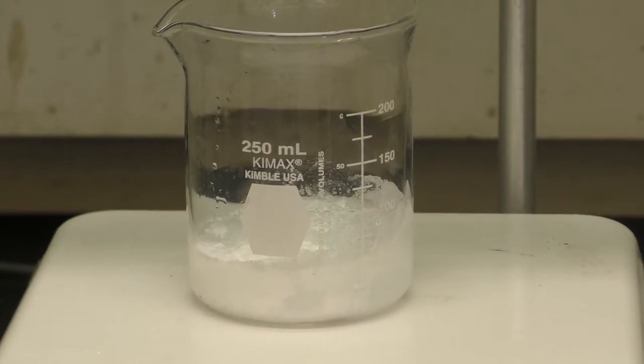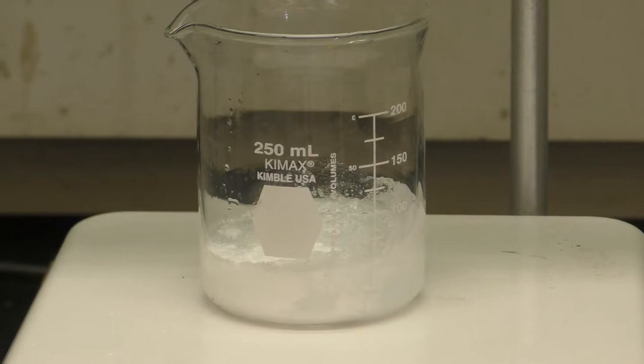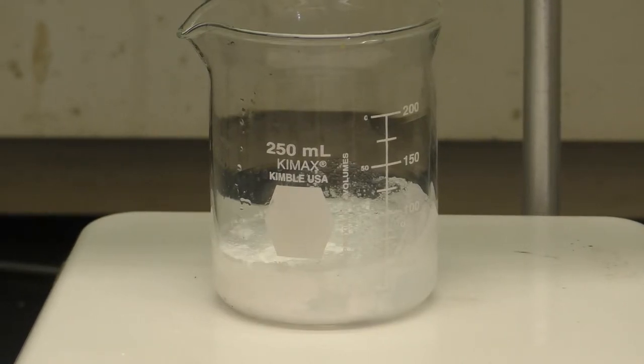Notice initially that a white precipitate forms. A lot of this is just sodium hydroxide that has come out of solution when we mixed it with the methyl salicylate. We don't want this solid sitting on the sides of the beaker as we boil the solution. So we'll set our temperature probe into the solution, set the stirring on, and then begin to heat the solution and use a little bit of distilled water to rinse this solid down the sides to keep it in solution.